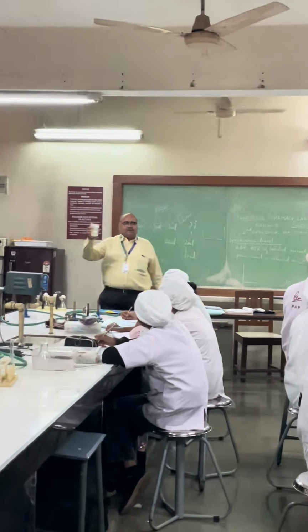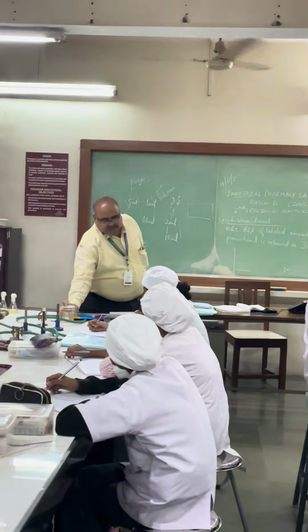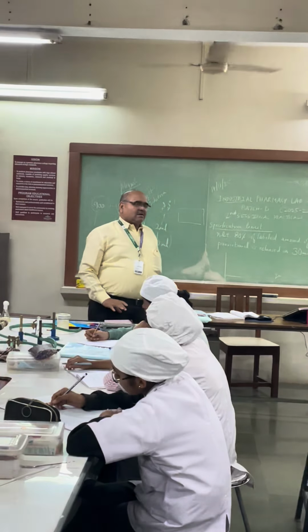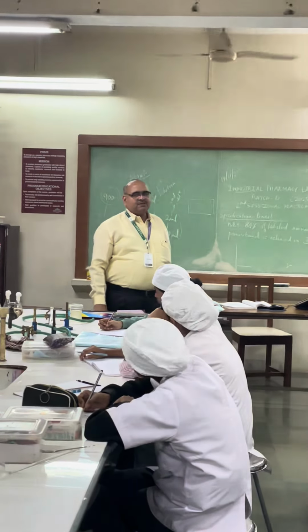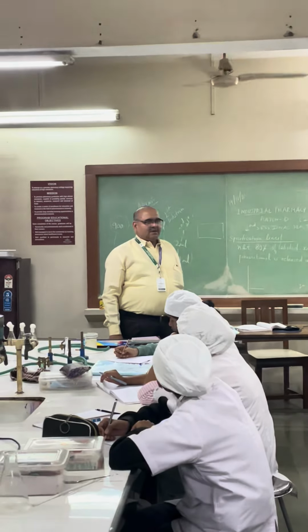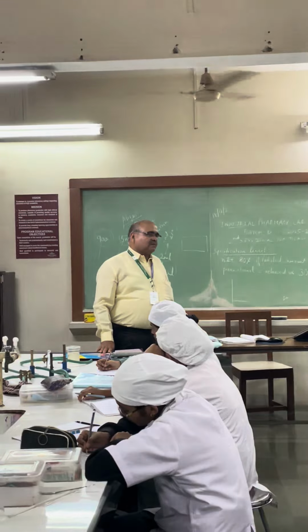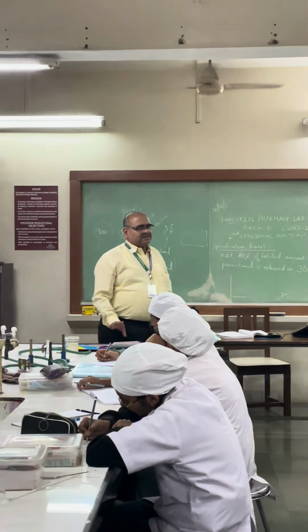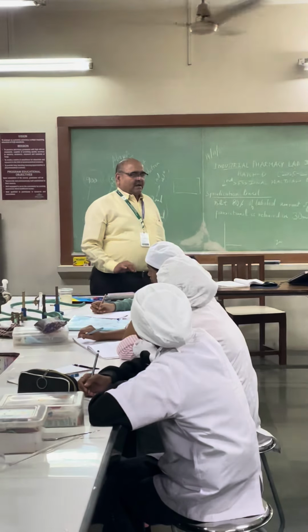This is the W2, which you are going to use. One group will use W2, another group will use W1. Now first group will use W1, second group will use W2. Have you understood the MPN practical? Yes.